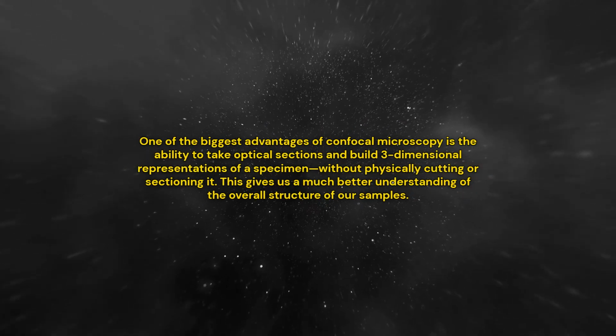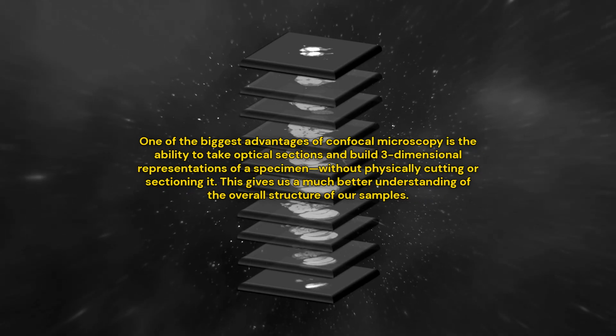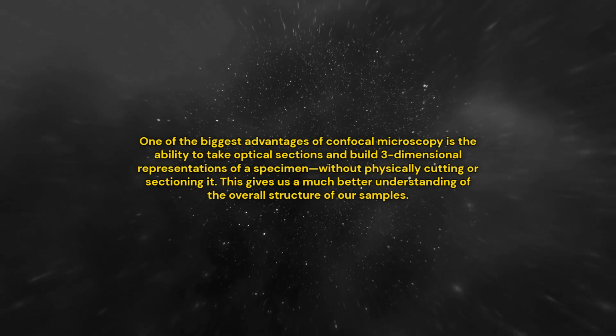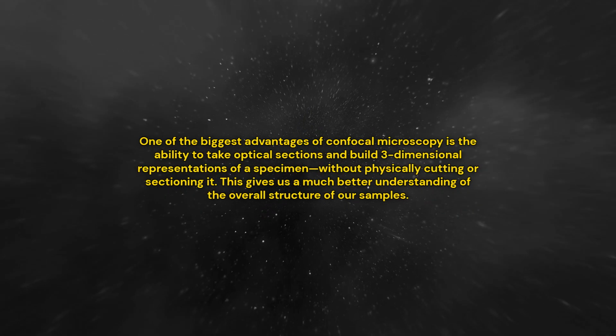One of the biggest advantages of confocal microscopy is the ability to take optical sections and build three-dimensional representations of a specimen, without physically cutting or sectioning it. This gives us a much better understanding of the overall structure of our samples.